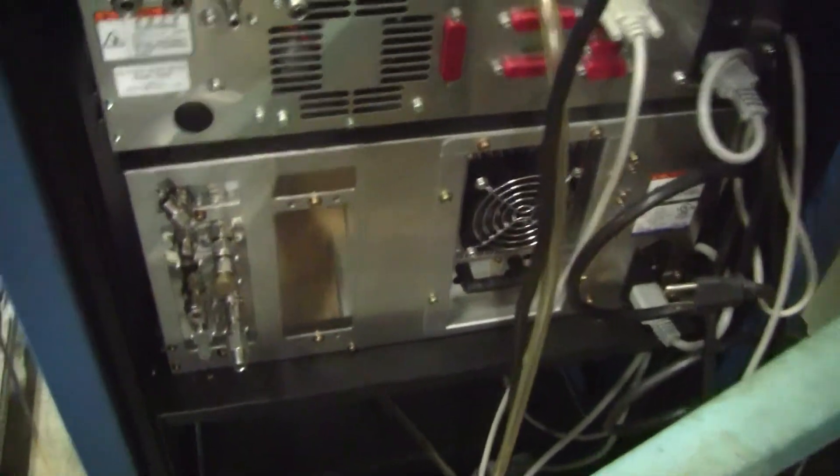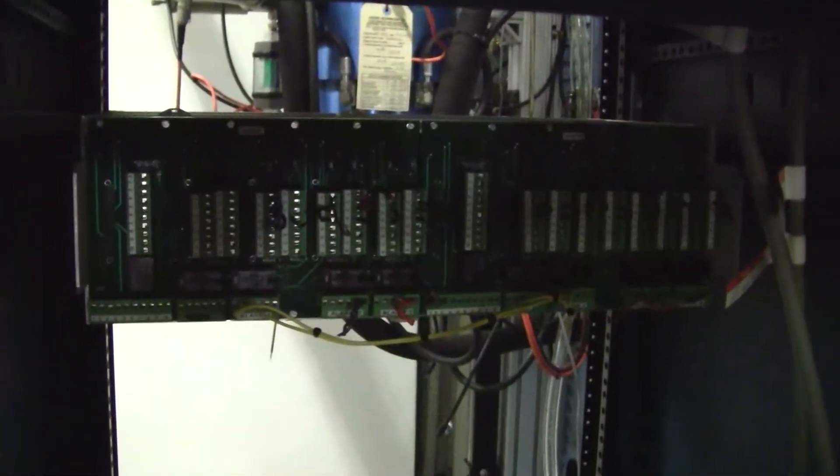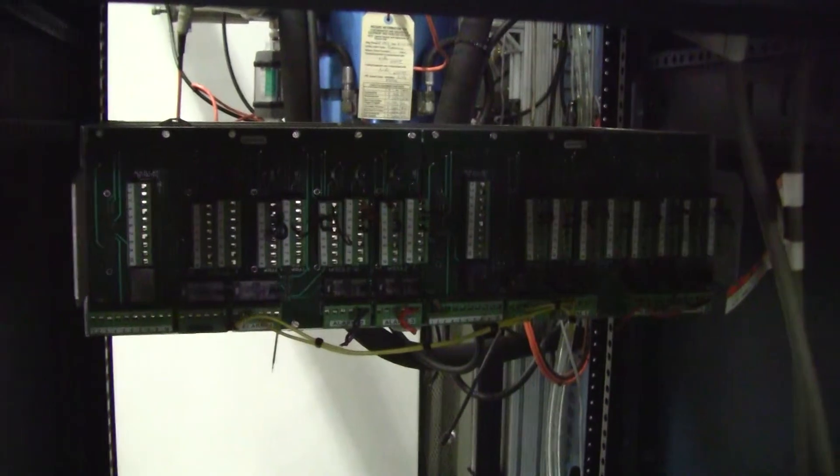Let's just take a look at the back of this unit. Somebody went in — not here, but when they disconnected it — as you can see, they took all the lead lines off, and that has to be reconnected on your end.